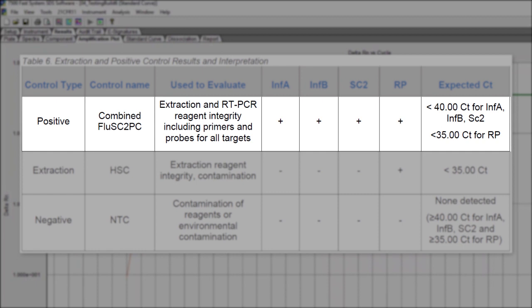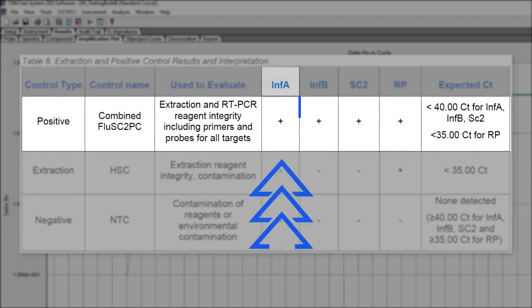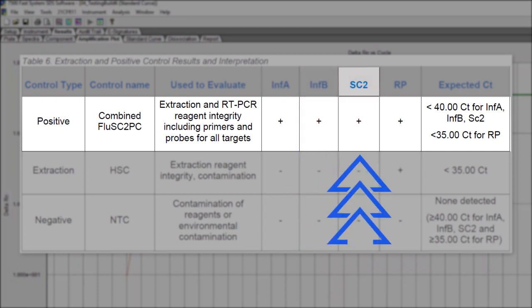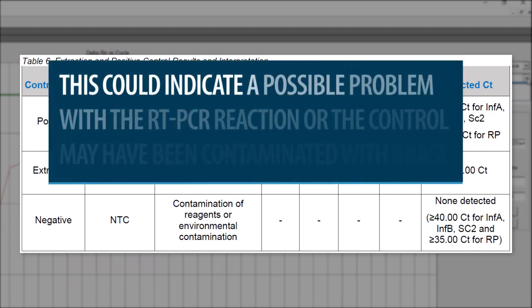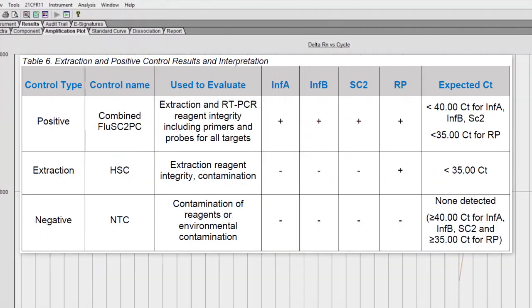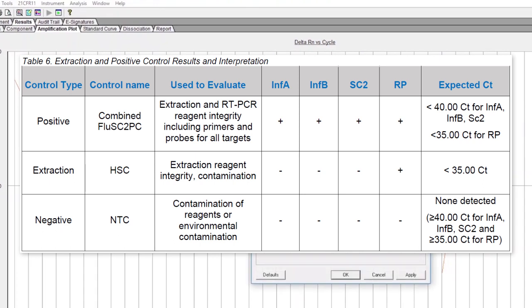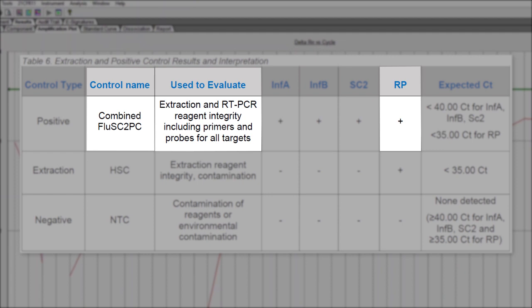If the Combined Flu SC-2 positive control reaction is positive for RNase P but negative for influenza A, influenza B, and SARS-CoV-2, this can indicate a possible problem with the RT-PCR reaction, or the control may have been contaminated with RNase, and the results are invalid. Make a new Flu SC-2 multiplex master mix and repeat the real-time RT-PCR testing. If the control is still only positive for RNase P, repeat extraction and testing of any clinical specimens extracted alongside the failed positive control.